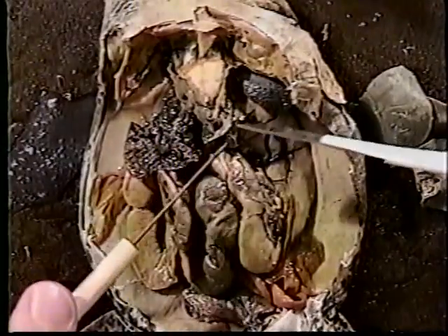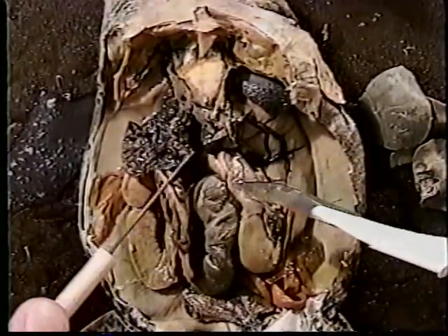The gallbladder's purpose is to store bile from the liver. It then gives this bile to the intestines as they need it. It is sac-like, and at closer examination, we can see that blood vessels also run through this organ.